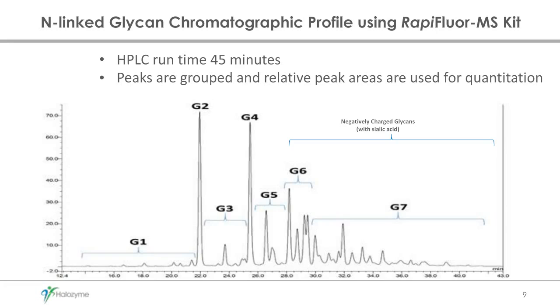I just realized I probably should have included the full profile, because since we don't do a cleanup step, we do get a lot of the excess dye at the beginning of our profile. But it is quite separated, so it doesn't impact our quantitation. I do believe you are able to do a wash step if you want. The kit has the procedure to do that, but we didn't think we needed it. If you do that wash step, you're adding more time and more sample handling to the process.